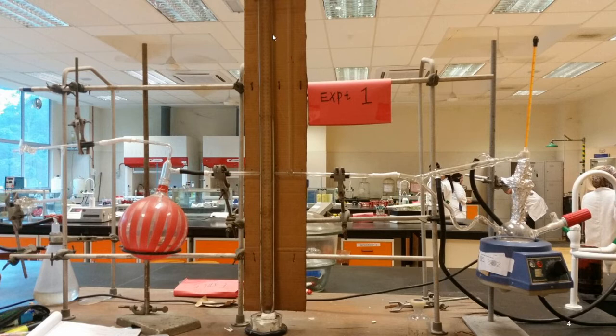At the start pressure, it will start boiling, and you'll record the temperature. You will see vapor coming out, and when it's stable, you will measure the difference. We'll talk about the levels later, but in essence, that's how you do the experiment.